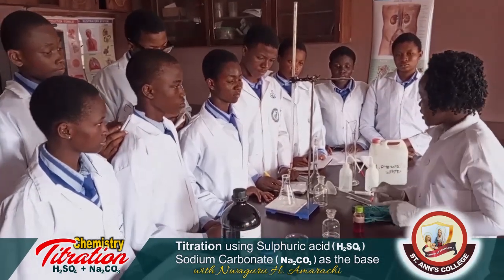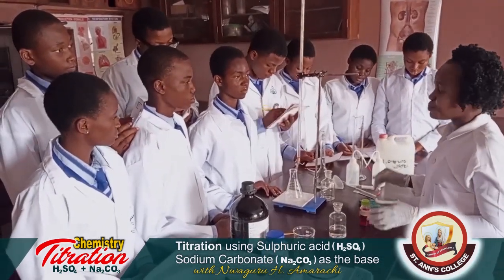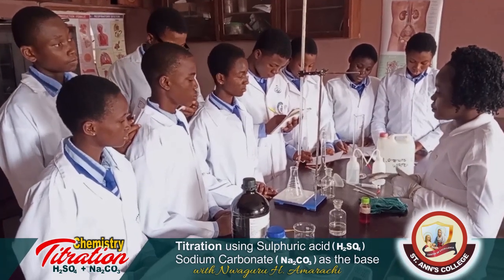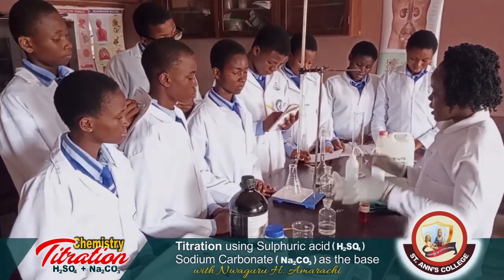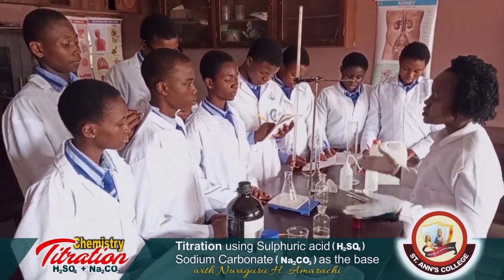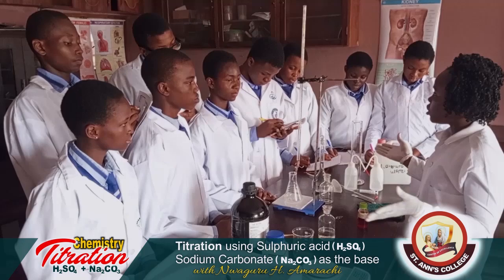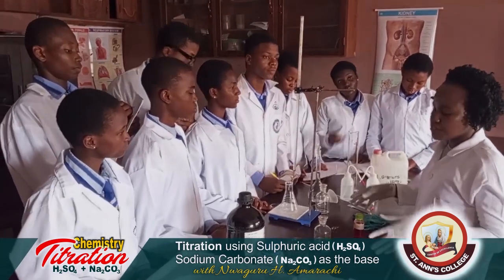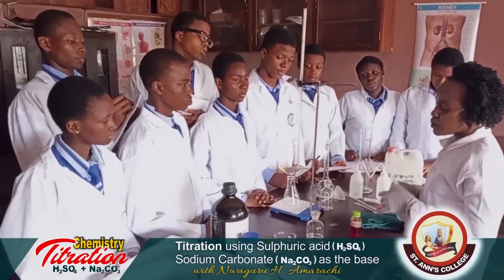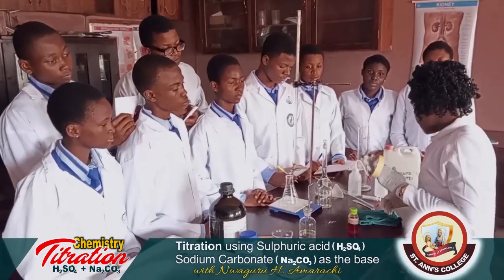Please note, every solution you prepare, you have to label it, because acid and base in a solution have the same appearance or color. You can see they are all colorless. So for you to identify the acid and base, you must do what? Label it using a paper tape.